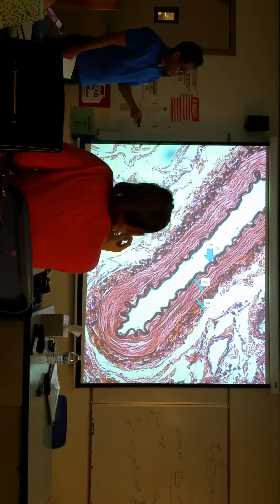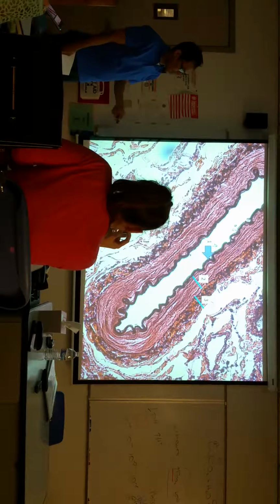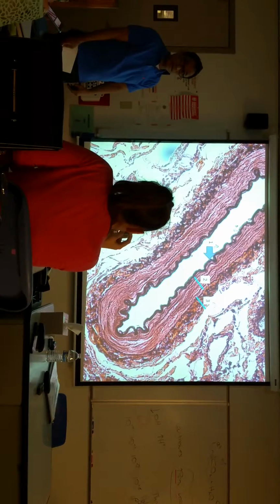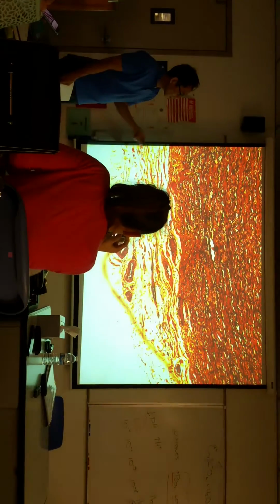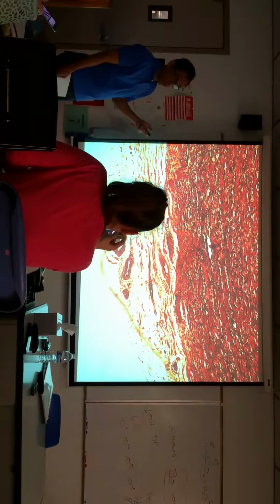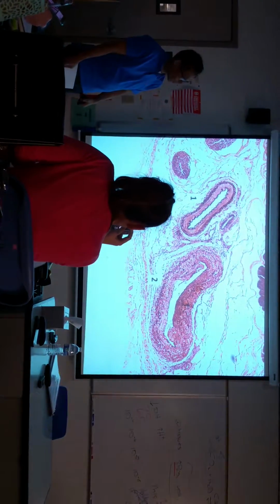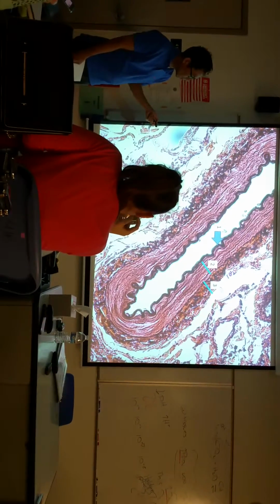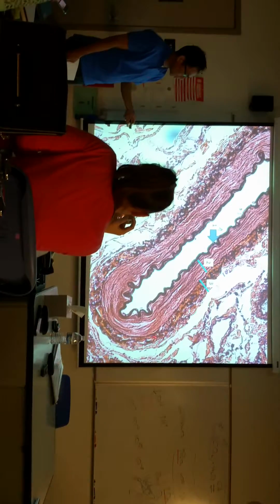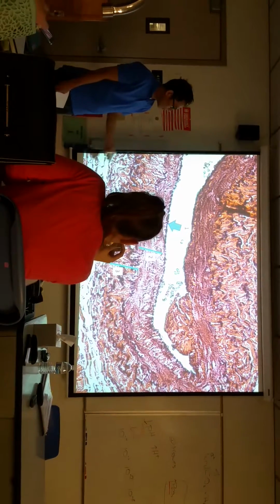Notice in the muscular artery, the tunica media is more pink, less black, because there's more smooth muscle content. It's called a muscular artery. Compare that with the elastic artery, where there's much more elastic. So that's simple to remember. Number 3, we have collagen fibers, and we see a higher elastic content in the tunica adventitia on this specimen. The vein, same deal.